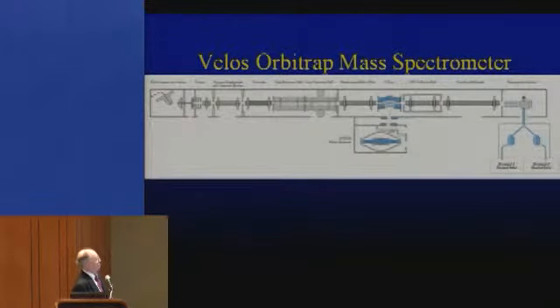But it became commercial. So the point is, what he's doing is generating his fluoranthene radical anions back here. He sends them all the way through this device to the linear ion trap, and then he fragments the peptides or proteins, and then he sends them to the C-trap and sends the ions into the Orbitrap. And I'll show you in a minute why I think that was a bad idea.